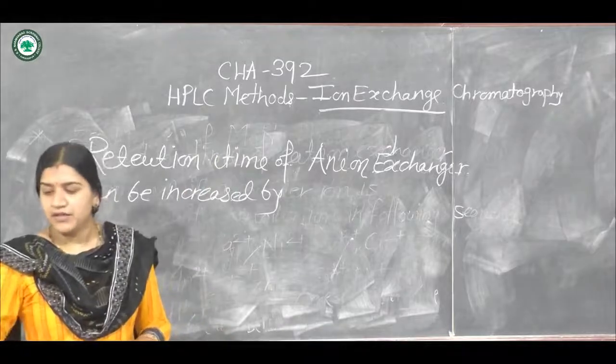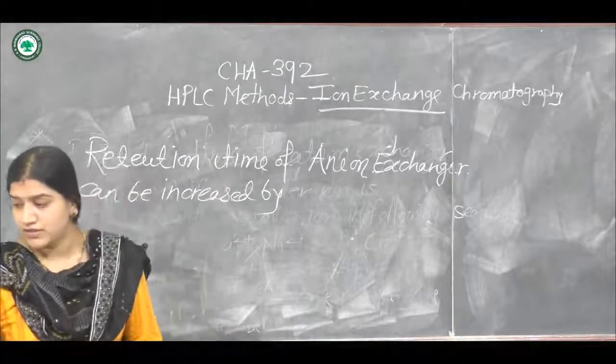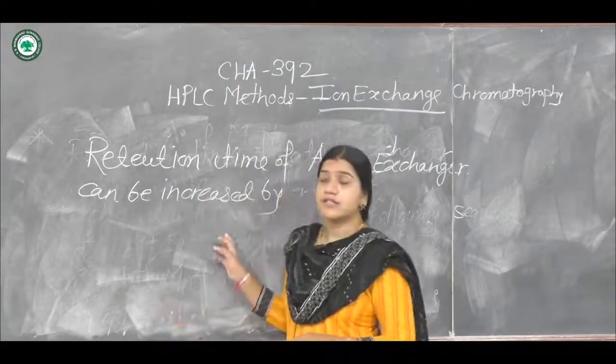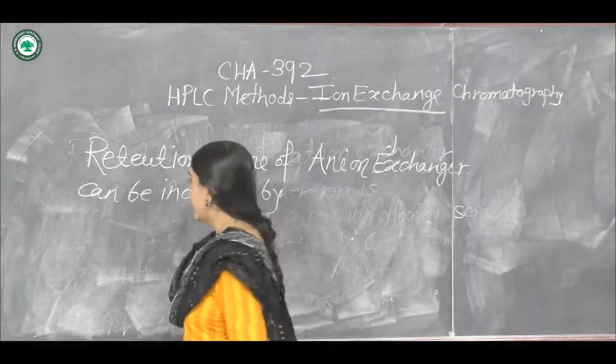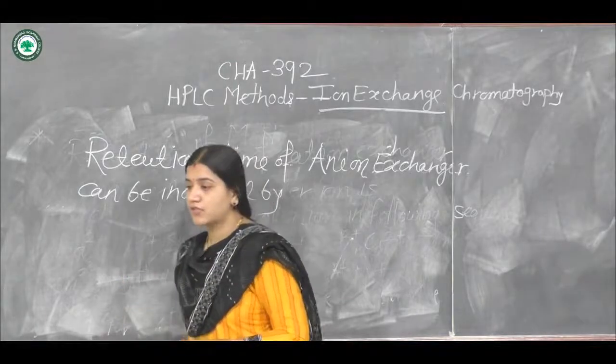It can be increased by using the following sequence. So what is the sequence for increasing the retention time of the anion exchanger? Here you are replacing the anion with another counter ion.